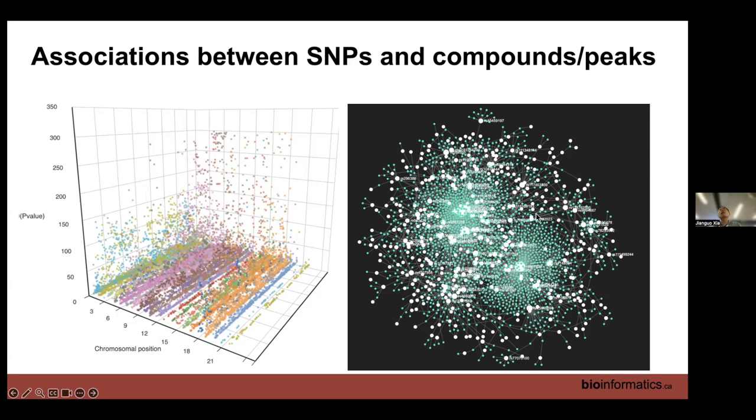And here's the network view. You can see some of the SNPs are identified by their ID, like RS296. This is not a gene, so it really has a SNP ID. You don't know clearly, but it is a unified ID associated with peaks. Some peaks are annotated, some are not, just m/z and RT. This SNP is functional because the SNP change is associated with the peak change. This is untargeted, I'm pretty sure, but for targeted you'll get the ID, okay?